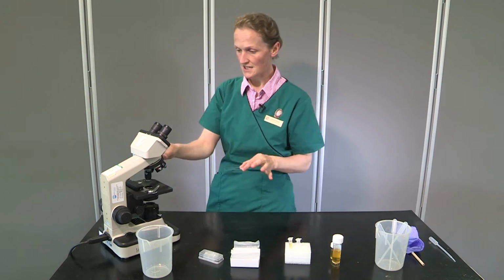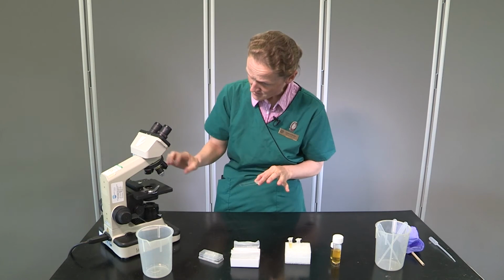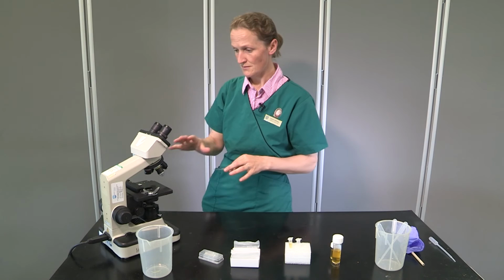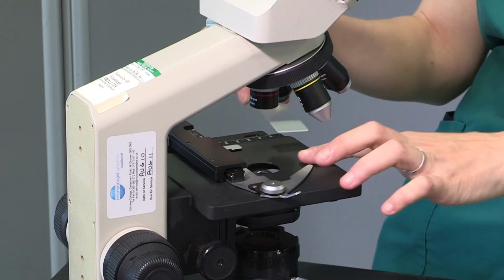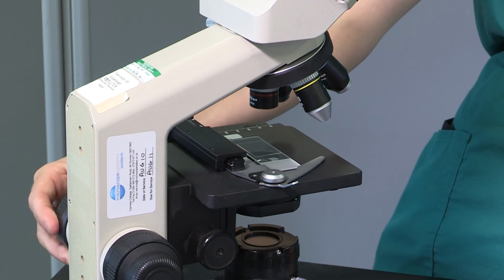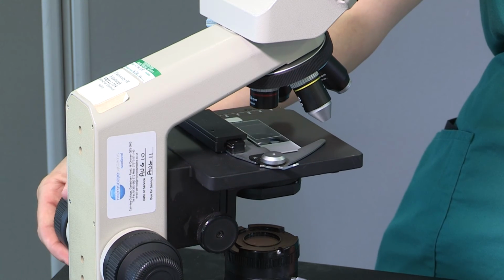Before I put my slide on, I'm going to make sure that I've selected the low power lens. I've dropped the stage down to the bottom to make sure that I don't damage anything when I'm using this microscope. Place the microscope slide on and then bring the stage up.